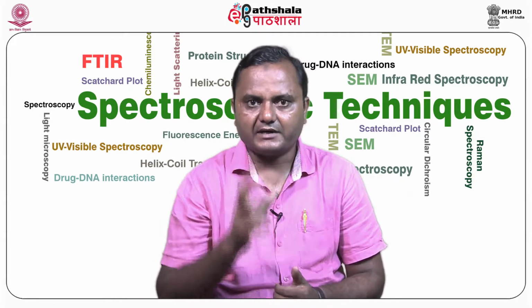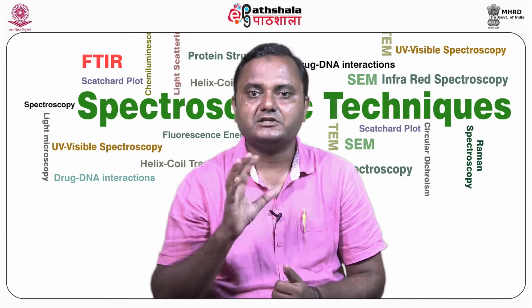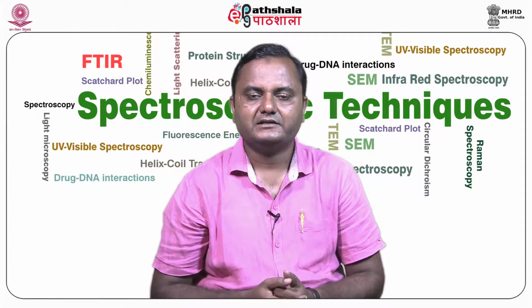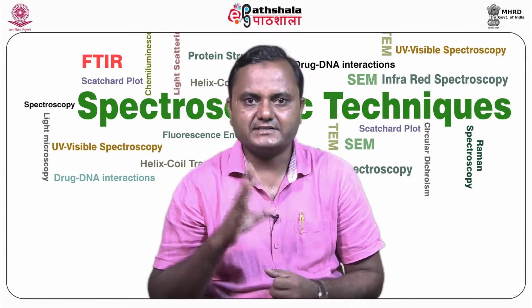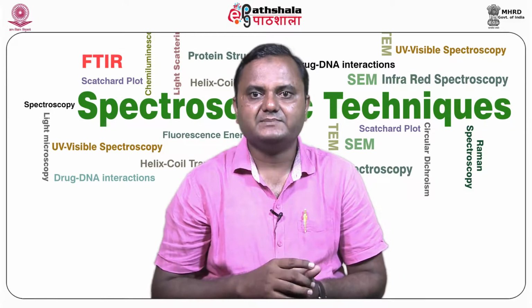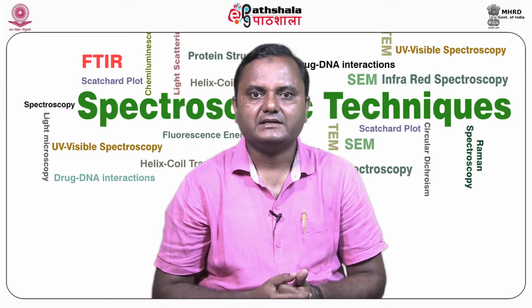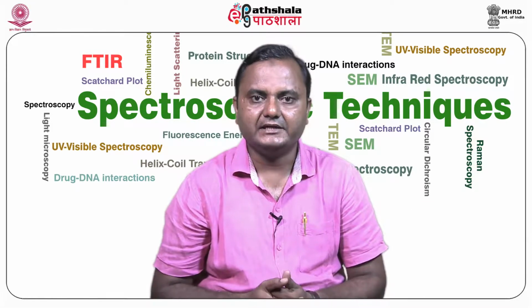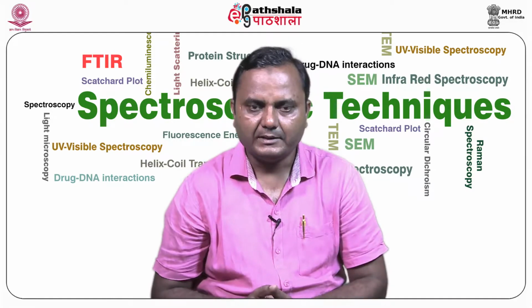The scattering particle is isotropic and there is no multiple scattering. All particles are considered as spheres and all particles have the same optical properties. Thus, light energy may be lost to absorption by the particles. It is applicable to all sizes, and we need to know the refractive index to calculate the size of the particle.